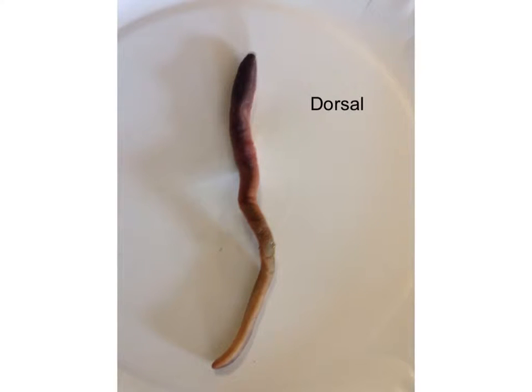Okay, this is for the students who missed the external worm or annelid dissection on September 28th, 2015. So we looked at the outside, or the external anatomy, of the worm. Right here the worm is facing us, its back is facing us, and its back is the dorsal surface. Just like your back is your dorsal surface, the dorsal fin on a fish is its dorsal surface, so the back is the dorsal. And it's usually dark. You can see how it's dark in this picture.